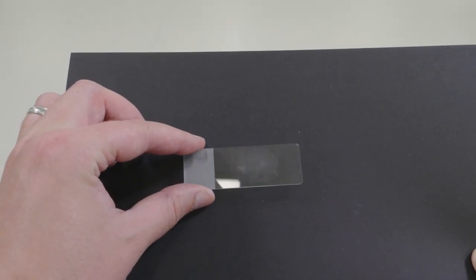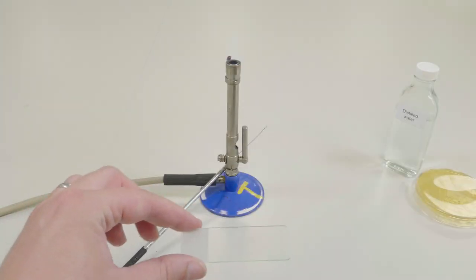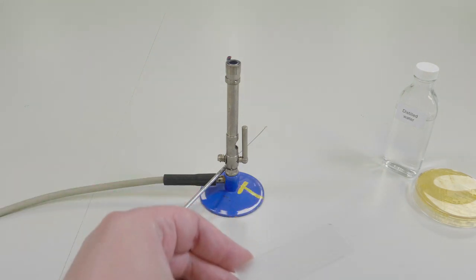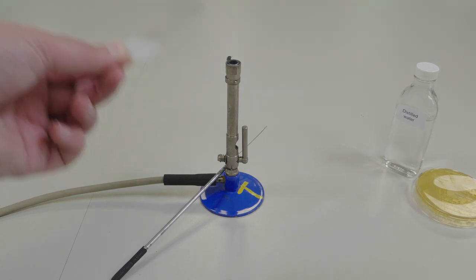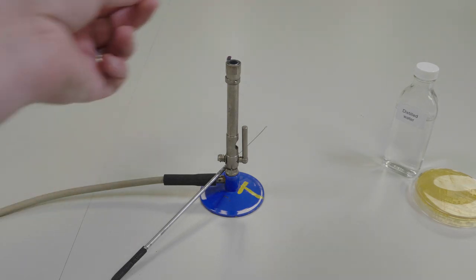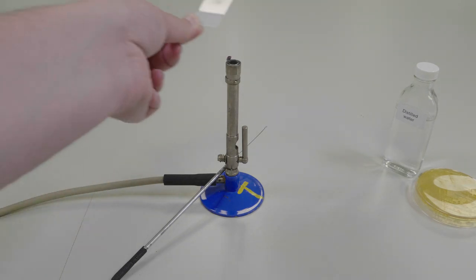Now you can see that all of the water has evaporated from my slide, so now I need to heat fix my film. This causes the bacteria to stick to the glass and prevents them from being washed away in the gram staining process.